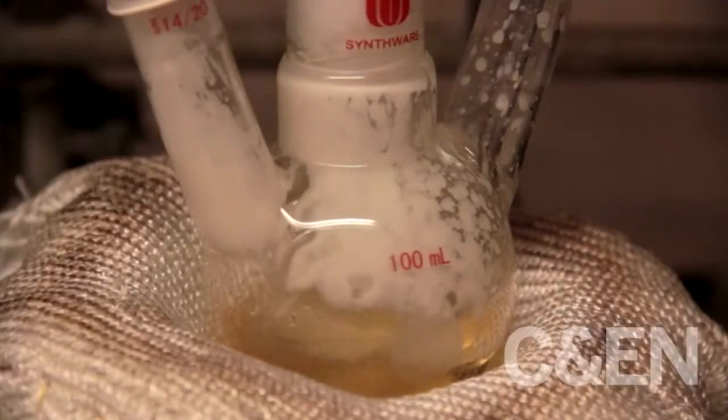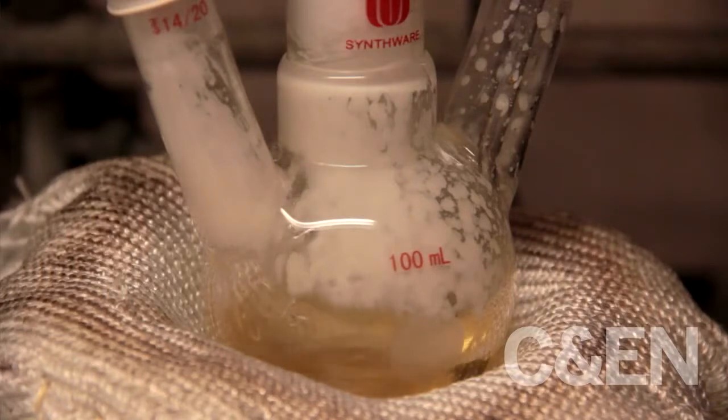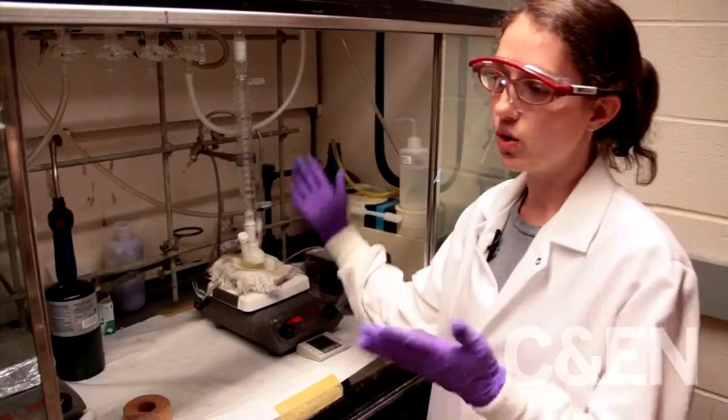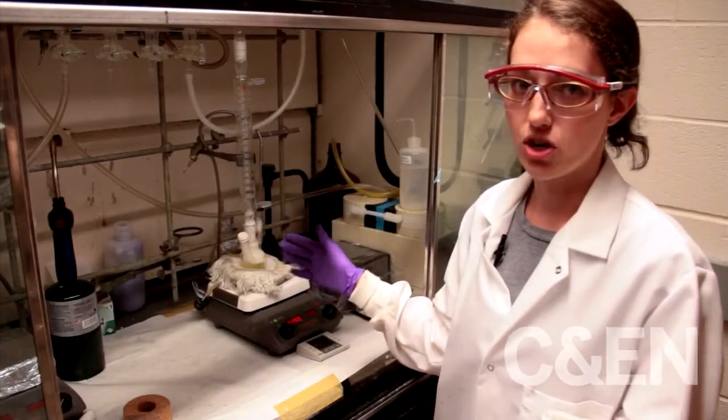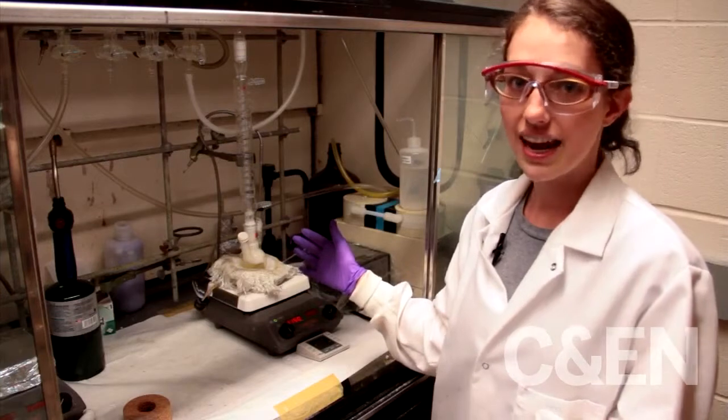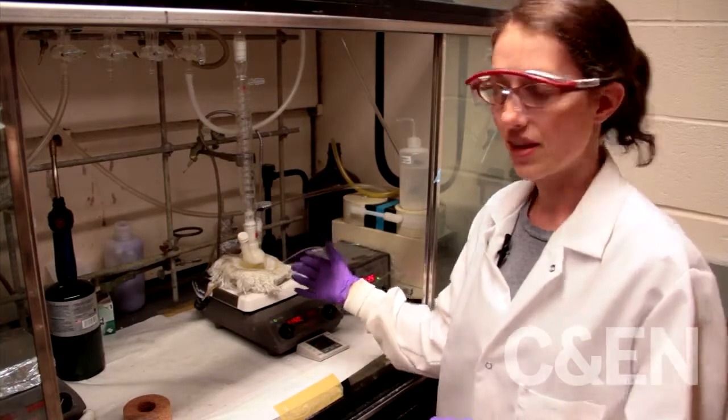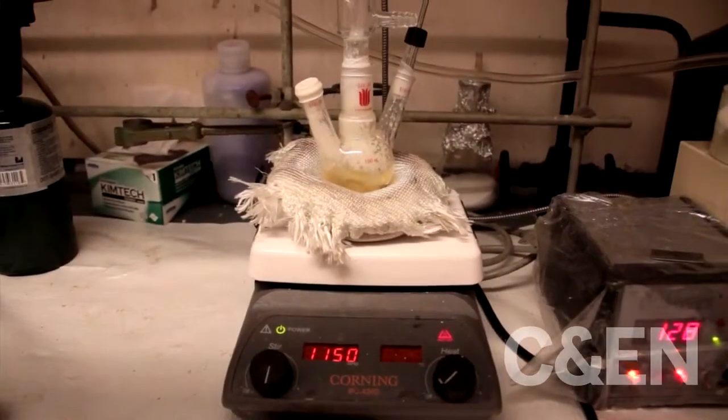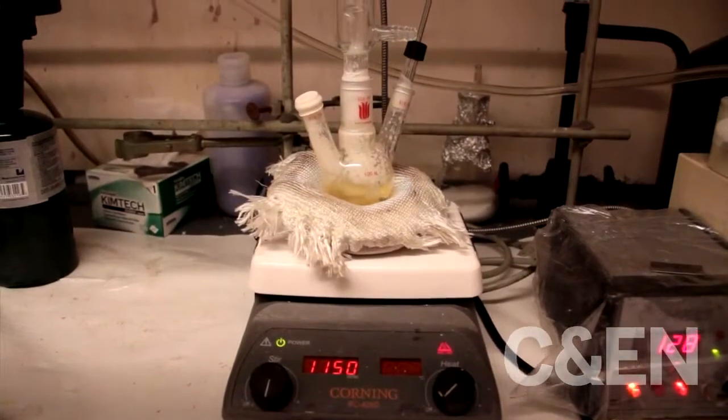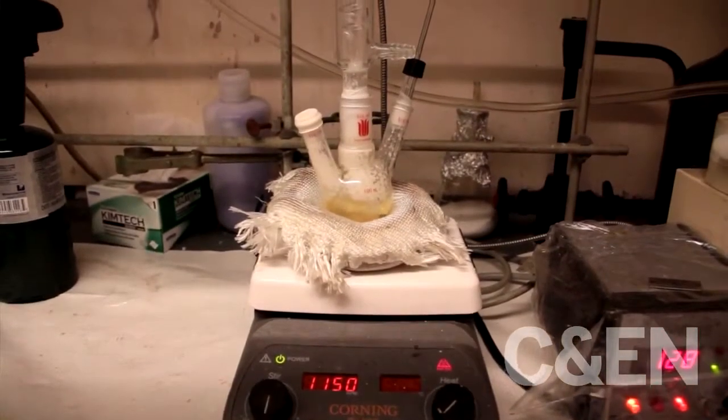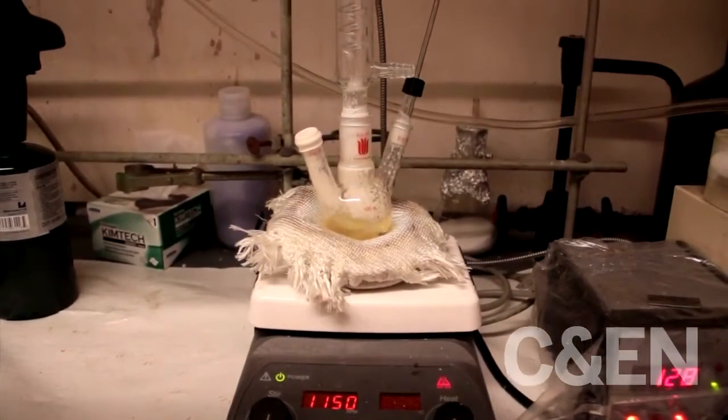In here we have some stearic acid and cadmium oxide that we heat up to dissolve the cadmium oxide in the stearic acid. Then we cooled it back down and added some tri-octylphosphine oxide and some hexadecylamine. We heated that up again until it all melted and we have been putting it under a vacuum to get rid of all of the water inside.